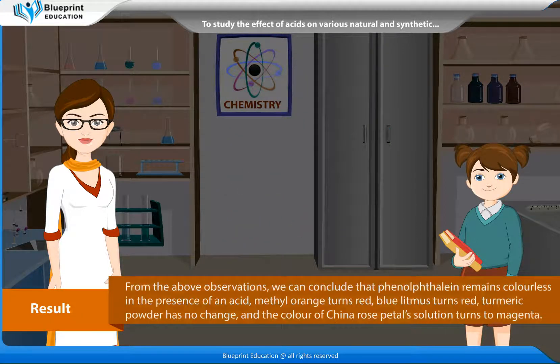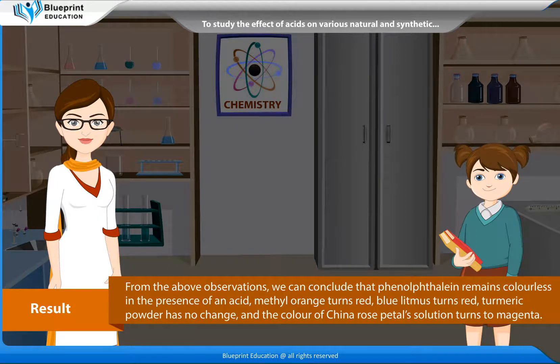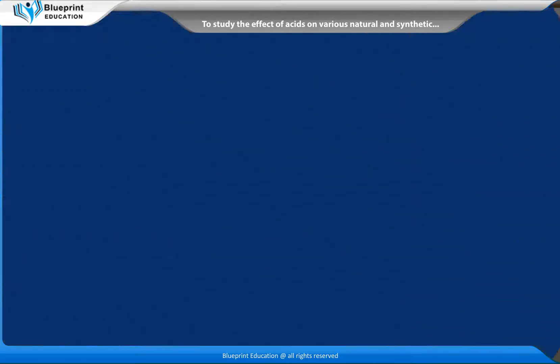Result: From the above observations, we can conclude that phenolphthalein remains colorless in the presence of an acid, methyl orange turns red, blue litmus turns red, turmeric powder shows no change, and the color of china rose petals solution turns to magenta.